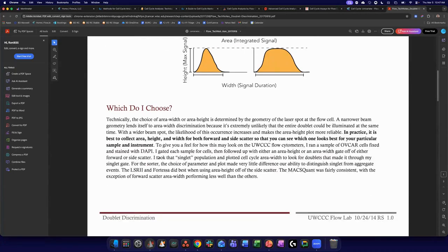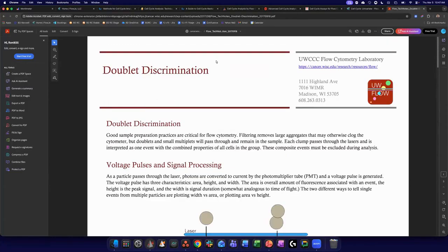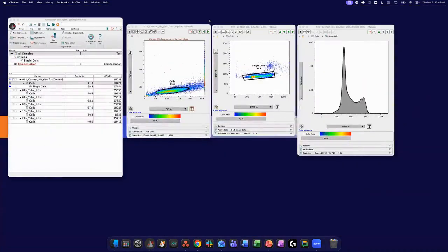So I would recommend this for a read if you find the doublet exclusion to be kind of confusing. Having understood what those are, you can see why it's still important, whether it's a multiploid or single ploid experiment, that we would likely still need to capture things on the ratio.